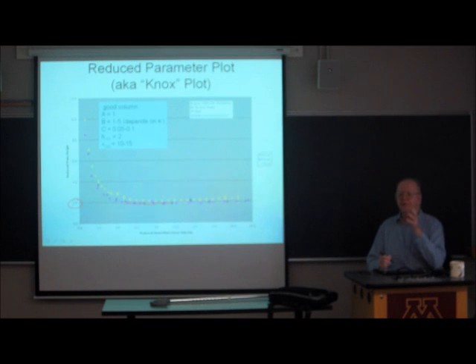If you want to know what's the best velocity to run at, for all three of these, it's somewhere between 6 and 8, close enough to 10 to say, who cares? Okay? So your best reduced velocity is something a little bit less than 10. Now, to calculate the actual velocity, you need to know the particle size and you need to know the diffusion coefficient.